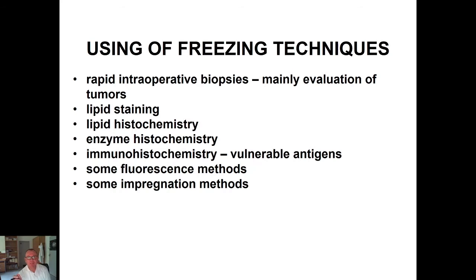This rapid intraoperative biopsy is done during the operation. The patient is still in the operation theater, still under general anesthesia, and the whole team is waiting for the result of the histological examination, and that's why it must be very rapid, very quick.